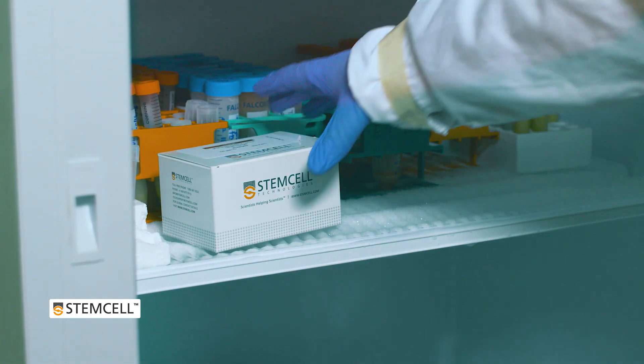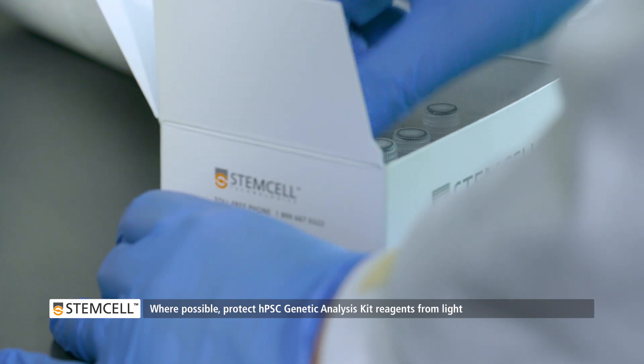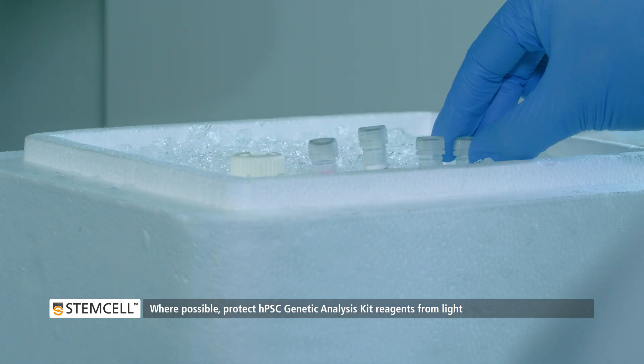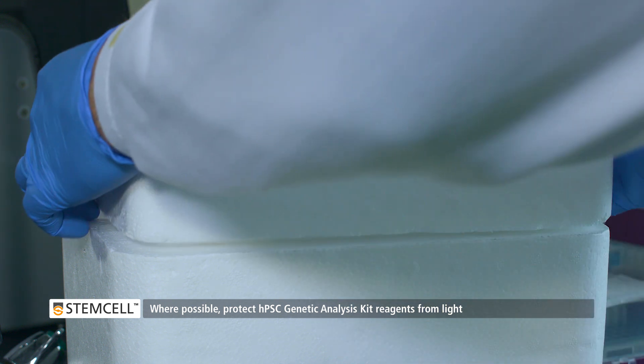Thaw all HBSC genetic analysis components on ice and protect from light. Before starting, genomic DNA samples to be analyzed should be placed on ice and concentration determined using a nanodrop spectrophotometer or other method.